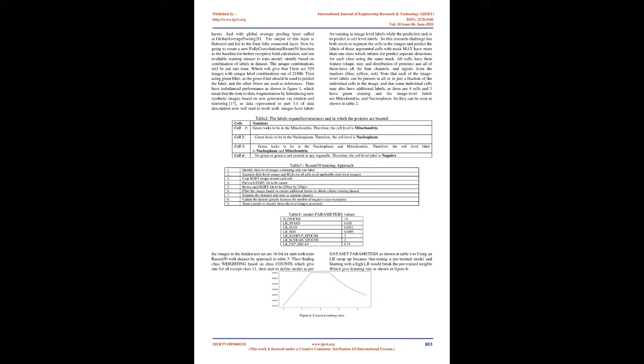Conclusion: we have demonstrated that the ResNet model, a 50-layer convolutional neural network, can achieve a classification accuracy of 91% for individual cells over 18 subcellular localizations, and 100% for proteins when entire cell populations of at least moderate size are considered. Far from being a black box, the internal outputs reveal ResNet's characteristics. The trained network functions as an extractor of features to successfully distinguish previously unseen classes.